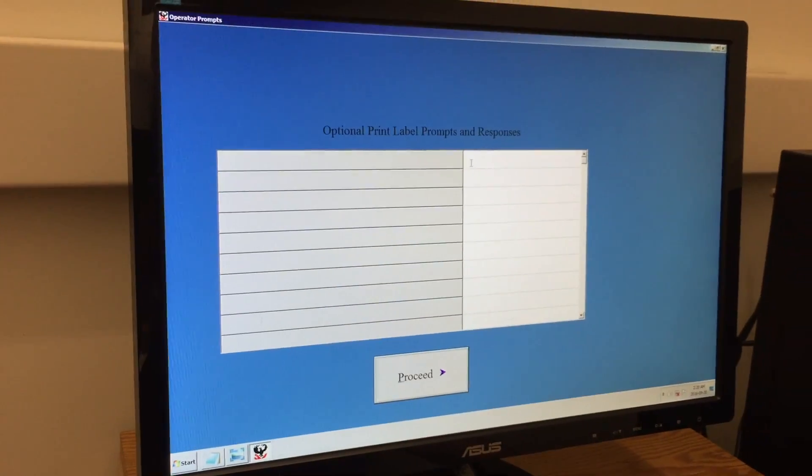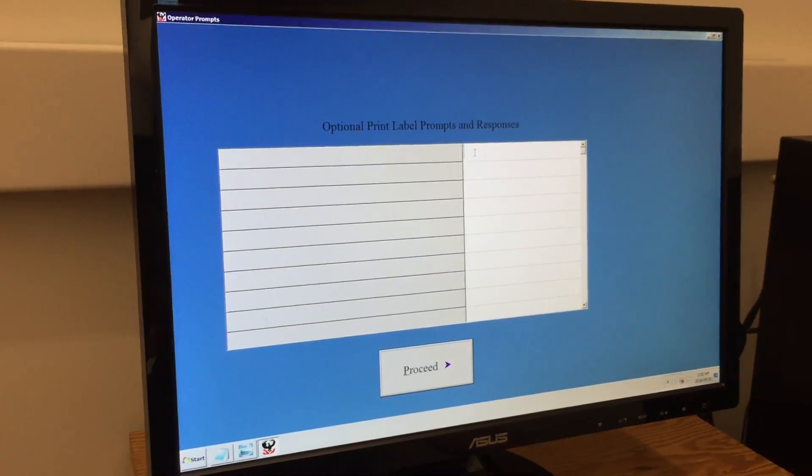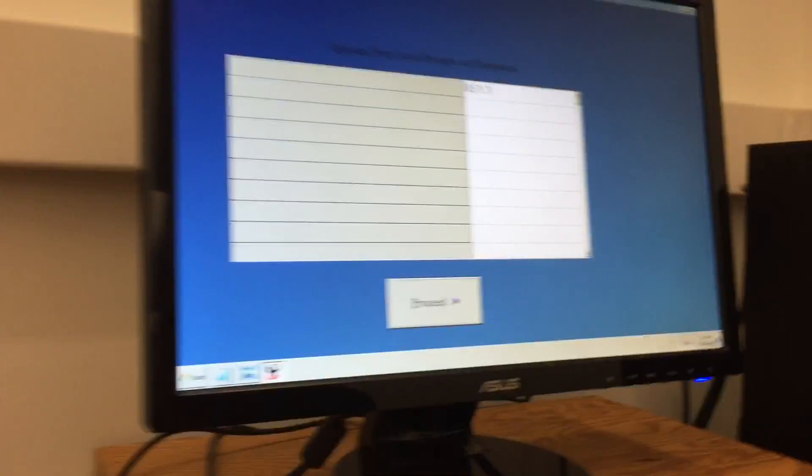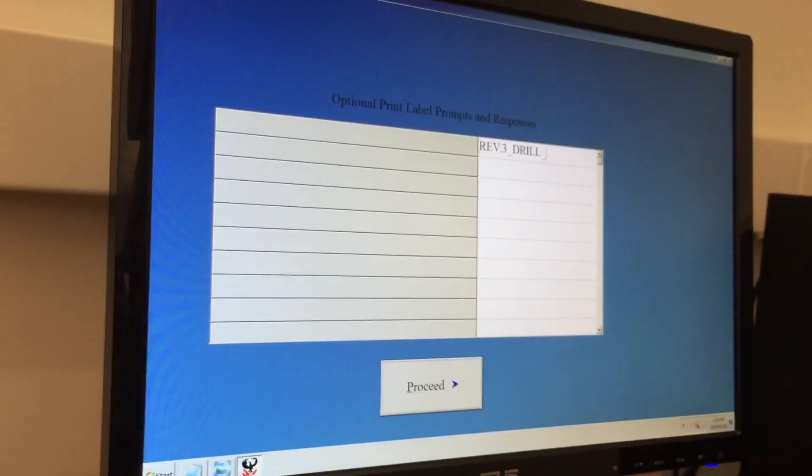The next screen is just to add a name to the test that you're running. Name it whatever you like, anything that is relevant.